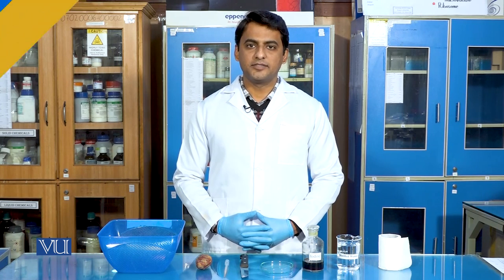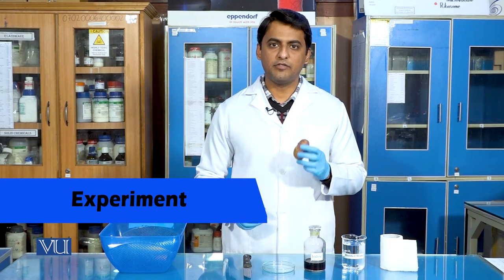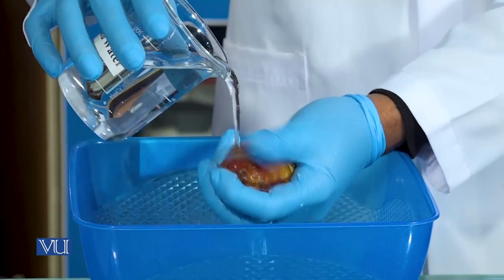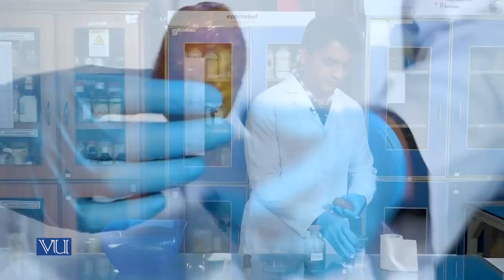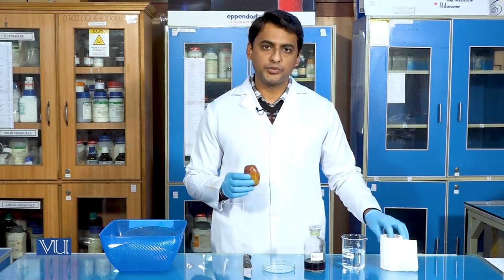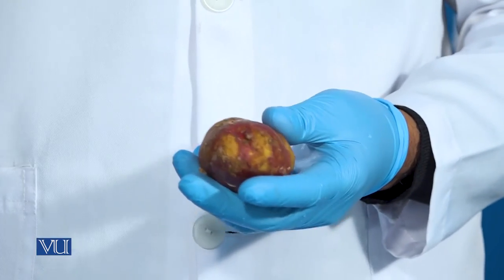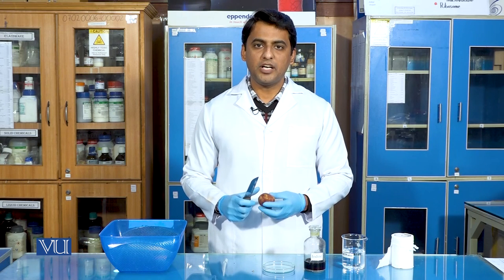Let's begin with our experiment. In the very first step, we will take a potato and wash it with distilled water. After washing the potato, we will now dry it with the help of tissues.